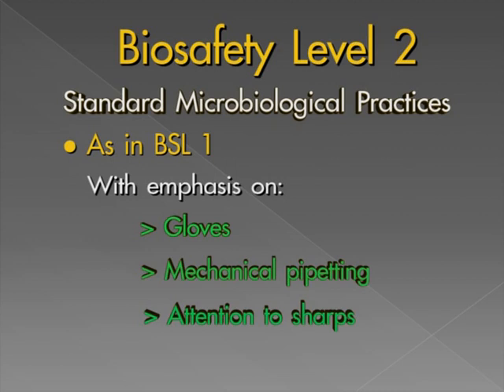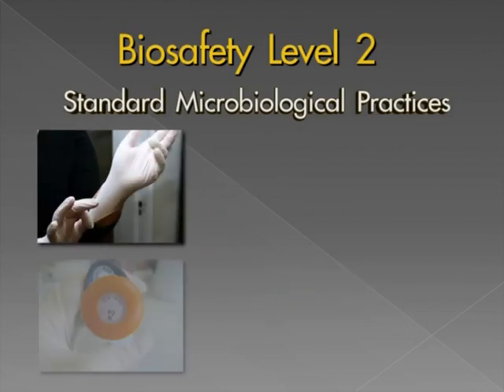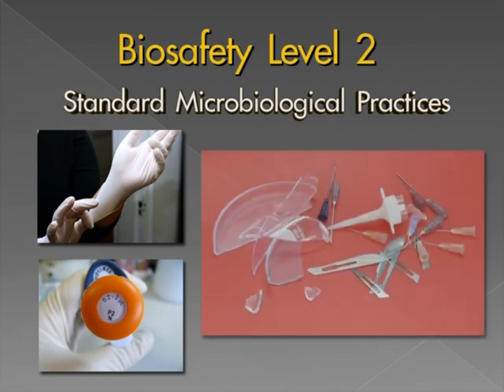As the biosafety level increases, all those microbiological practices and procedures delineated for the lower levels are carried forward to the next higher level. Thus, the standard microbiological practices required at BSL-1 are still in effect at BSL-2, with emphasis on wearing gloves, using mechanical pipetting devices, and attention to handling sharps.